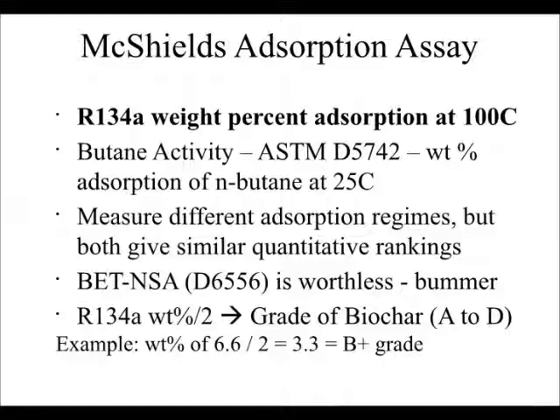Turns out BET carbon dioxide is substantially done at 0 degrees C. So we haven't frozen the tars, or we haven't removed them so much from the actual soil environment, and the diffusion is monstrously fast.